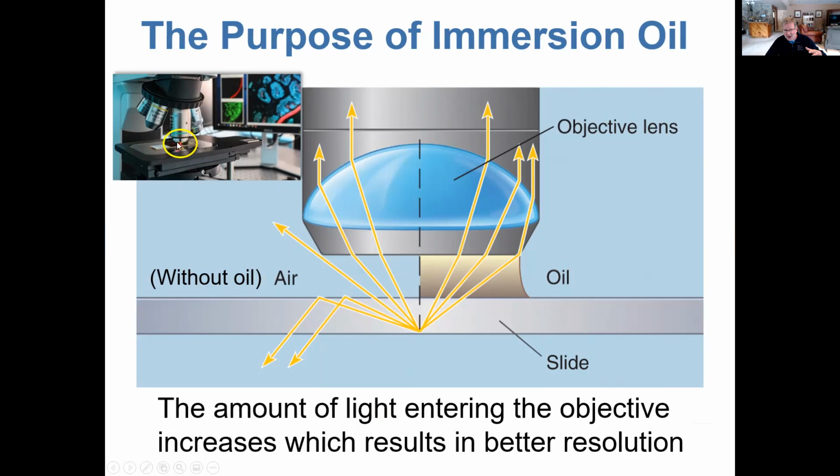They'd be sliding off this direction, that direction. And there'd be other light rays that would diffract off the top surface of the glass slide and bounce downward away from the objective, off to the side. So there's a considerable proportion of light rays that are not going to be bent in the proper way to go up and enter into your eye if you don't use oil.